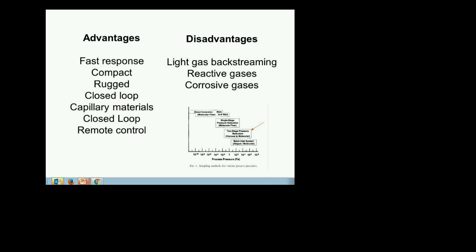There won't be any residual effect from it. Bring it close to the ionizer and see how close you can get before you have a problem. Then bring it to the electron multiplier and see how close you can get. That will give you a sense of where you need to be in the mounting position. This comes up all the time. Yeah, it's a common question.